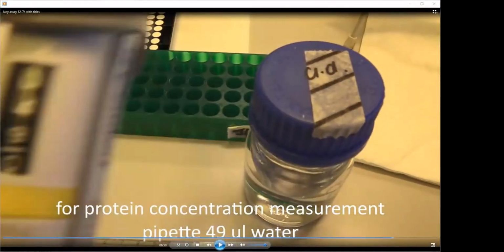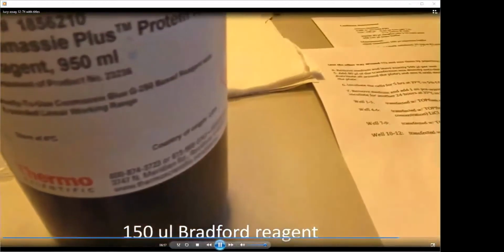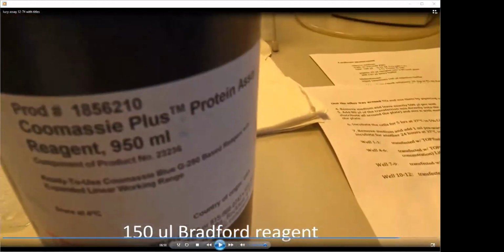I told you that in this particular case, because these cells contain beta-galactosidase activity, that would not reflect the transfection efficiency. And therefore, I decided to do a different normalization, and that is on the total protein amount per sample. For that purpose, I have used the so-called Bradford assay, where you have to mix water, 49 microliters in this case, with 150 microliters of the Bradford reagent, which you can see here.